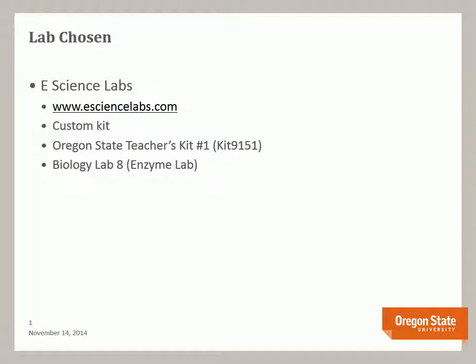It's one of the custom kits. Specifically, it's titled Oregon State Teachers Kit number 1. When searching for it, you look for KIT 9151. The lab that I chose from this kit was Biology Lab 8, which is the enzyme lab.